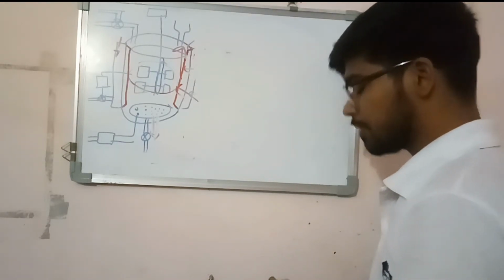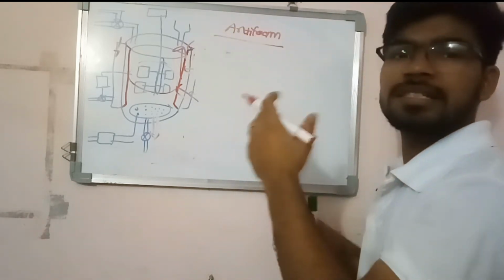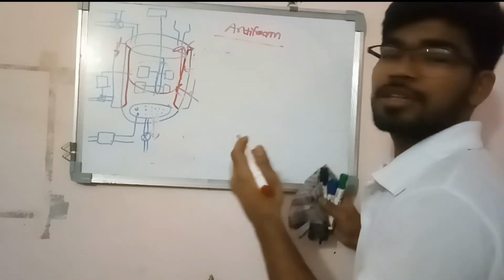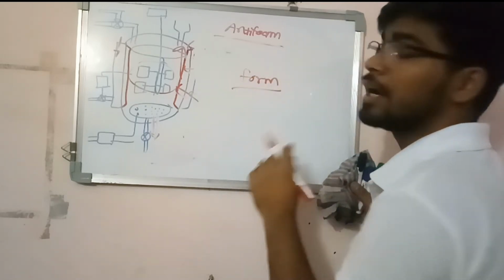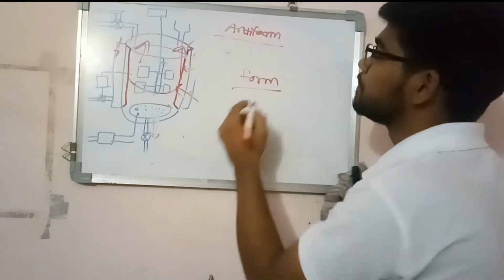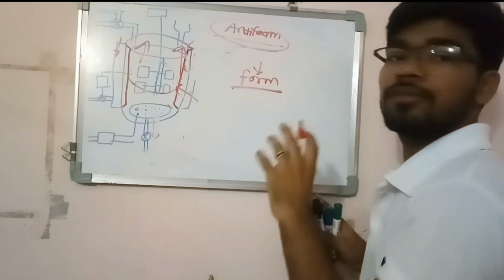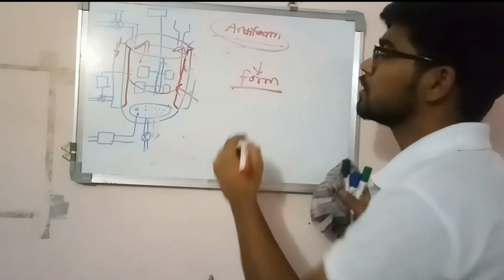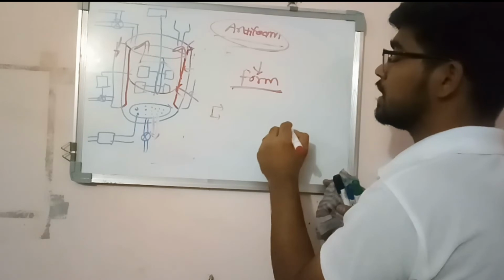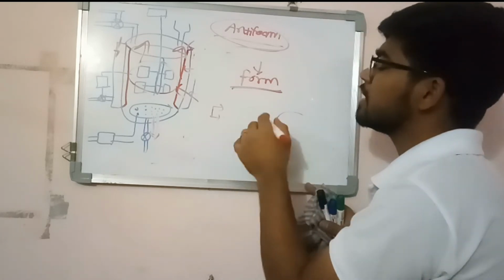The next thing is anti-foam agents. They may be added subsequently or before the batch starts. What does anti-foam do? During fermentation, foam is generated, as we know, and as foam goes higher, it does the same thing the vortex does. So anti-foam agent should be added so that only limited foam is generated. It may be dosed mechanically or directly, and when it reaches a certain point, a computerized anti-foam agent is added and releases the foam.